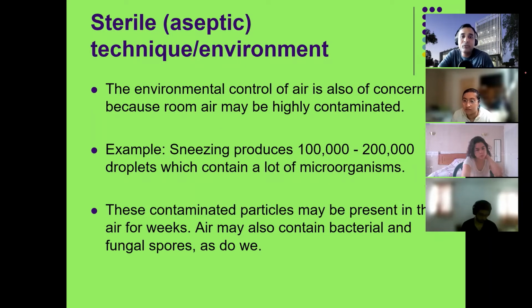Just one example. If you sneeze in front of the hood, meaning the laminar air flow, just from the droplets you are producing up to 200,000 small particles from your mouth, okay? When you kiss someone, within the case, we exchange more than 600 different kinds of microorganisms, okay? There is a book that I published 3 years back, and we put that data in that book. Kissing someone is interexchanging 600 different bacteria, okay?